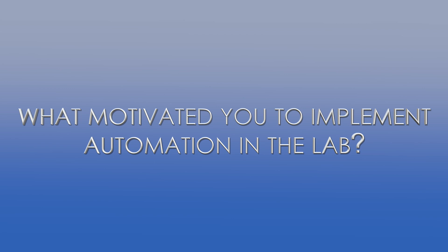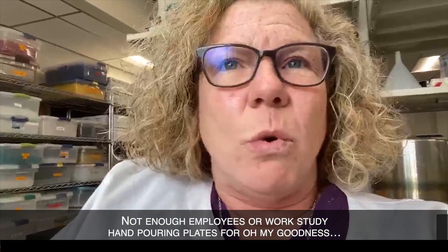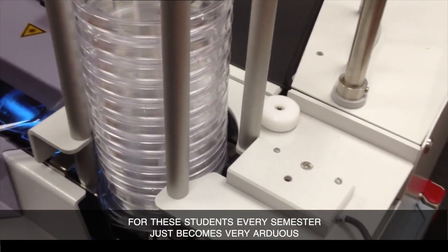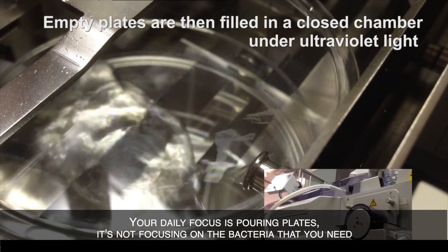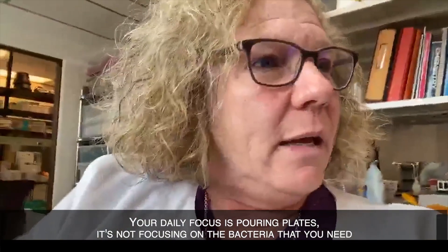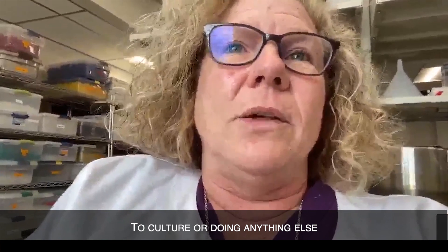When you have so many students and not enough employees or work study, the hand-pouring of plates for these students every semester just becomes very arduous. And your daily focus is pouring plates — it's not focusing on the bacteria that you need, the culture, or doing anything else.